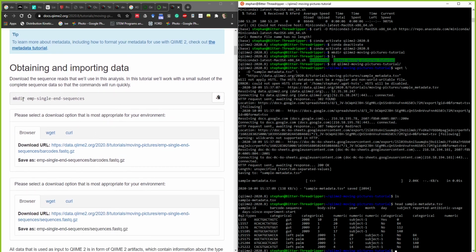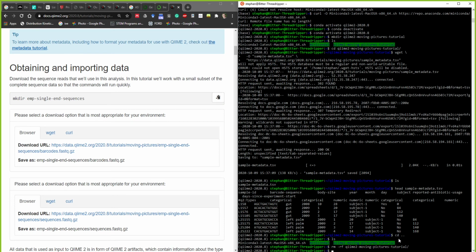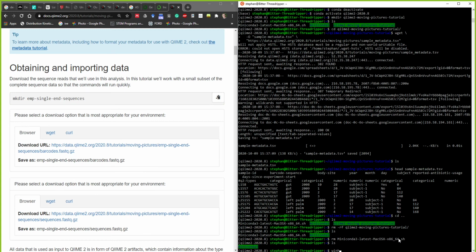Yeah, the next step is going to be to make directory. What's that? For those that want to visualize that TSV file, you can open it using Excel or Numbers, for instance. But yeah, you can. Basically what you did is showing it all. But this is for students that don't know where those files are. Where is the make directory? Where did it bring it to?